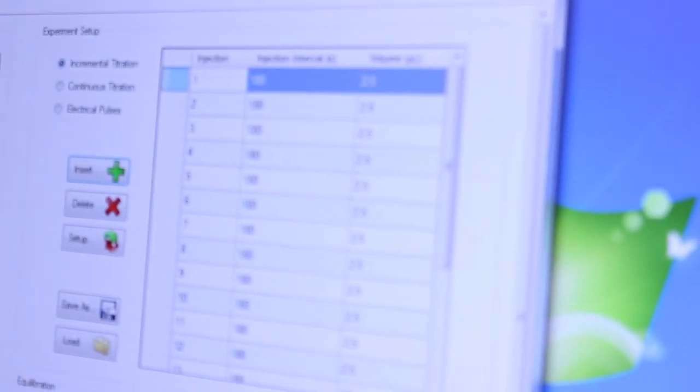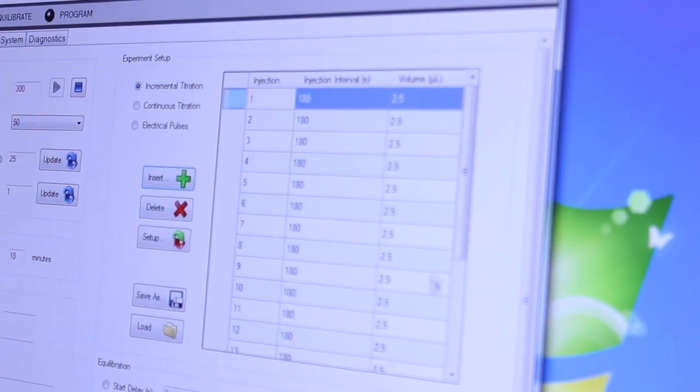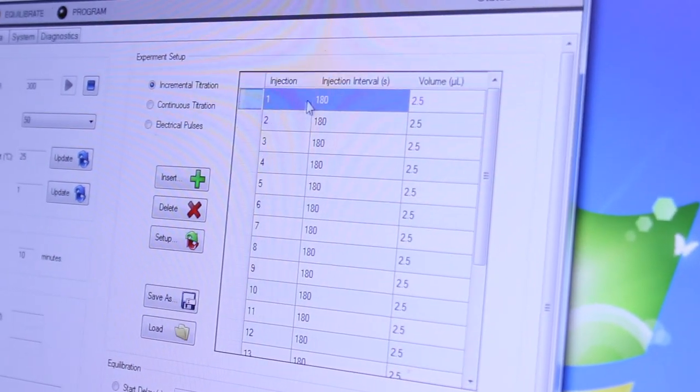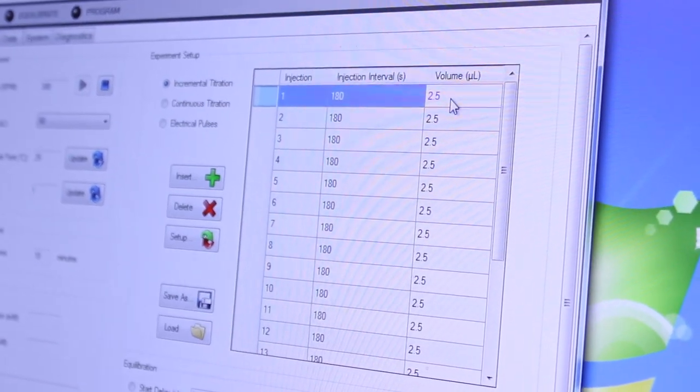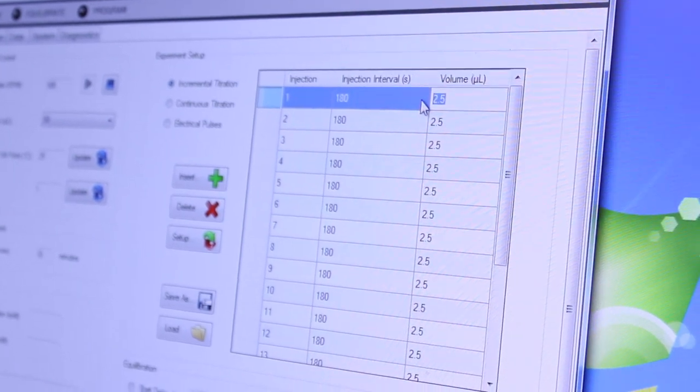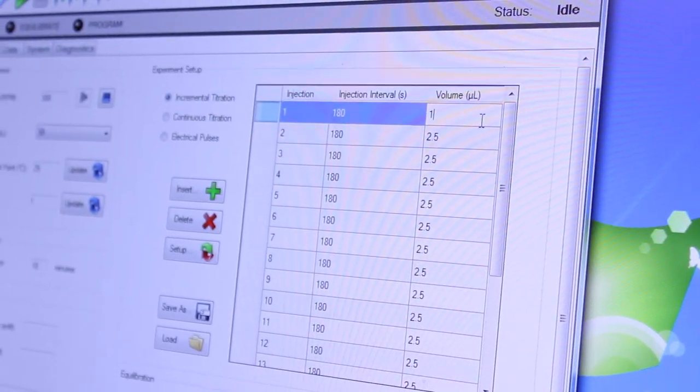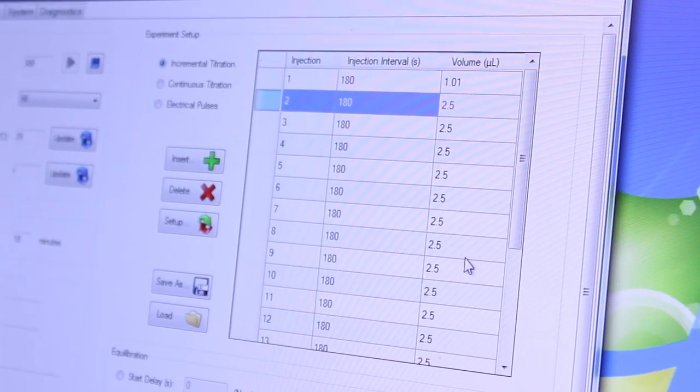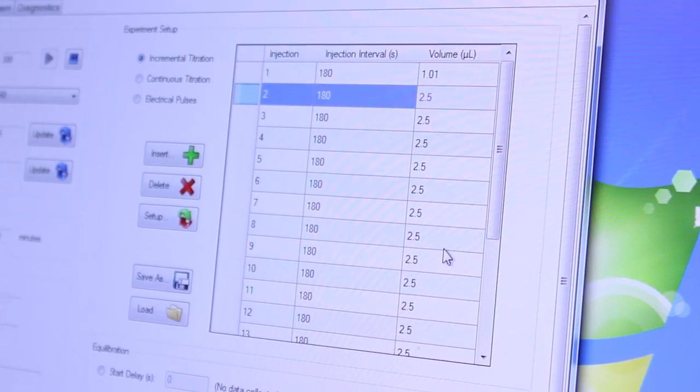That will fill out the table. In many cases the first injection will have a large error so it can be a good idea to reduce the volume of the first injection. Talking to the applications hotline can help provide advice with this if you don't know.